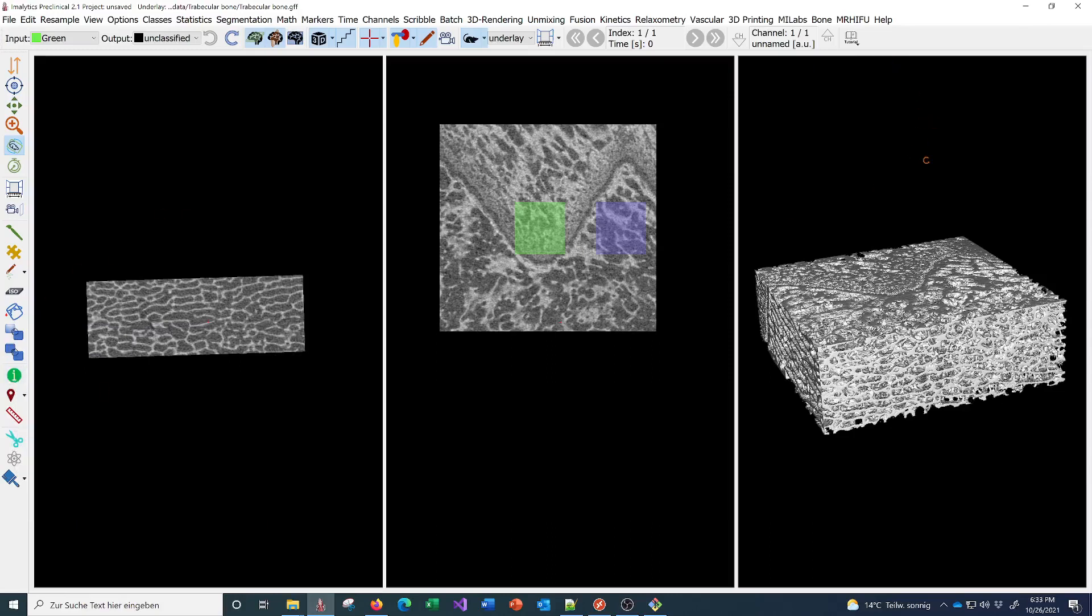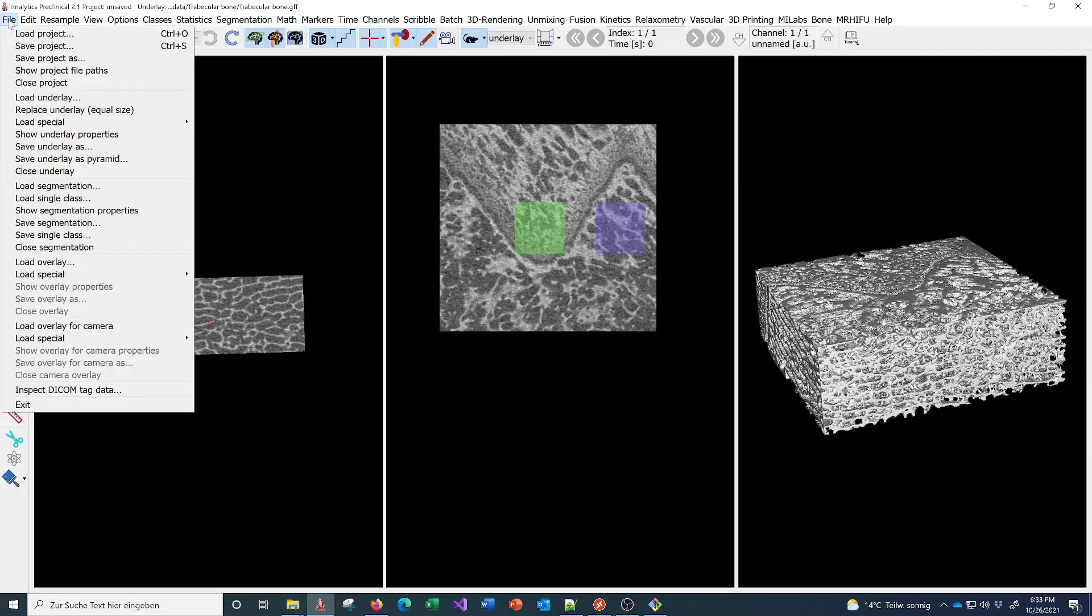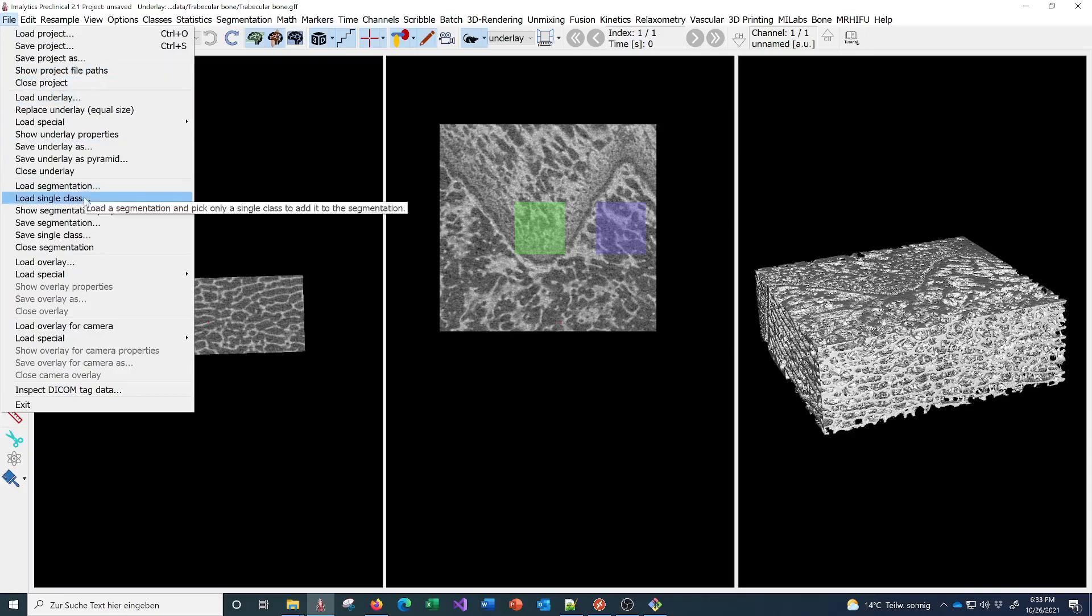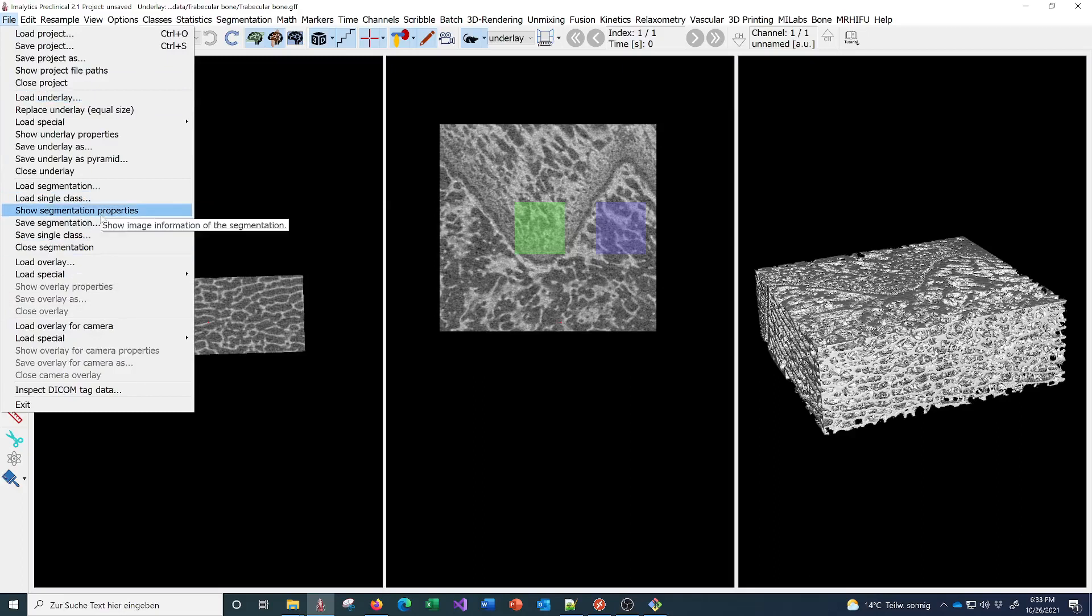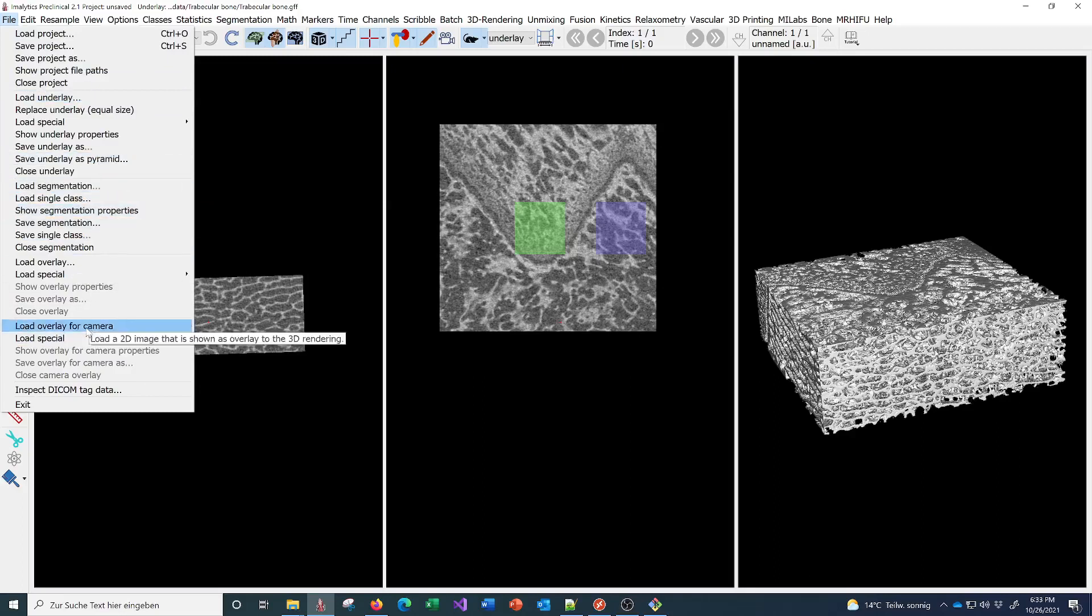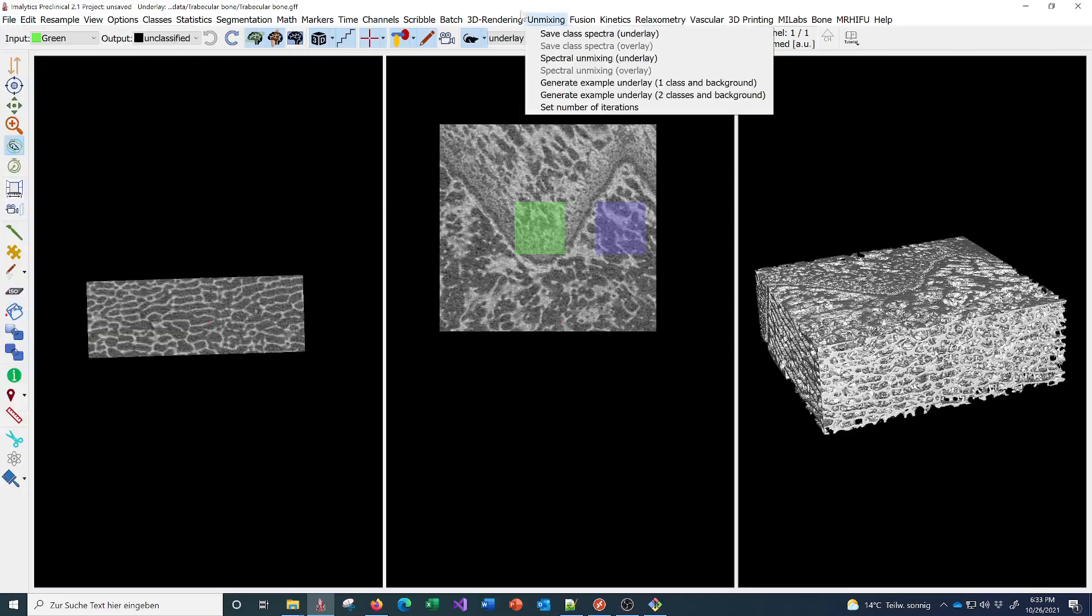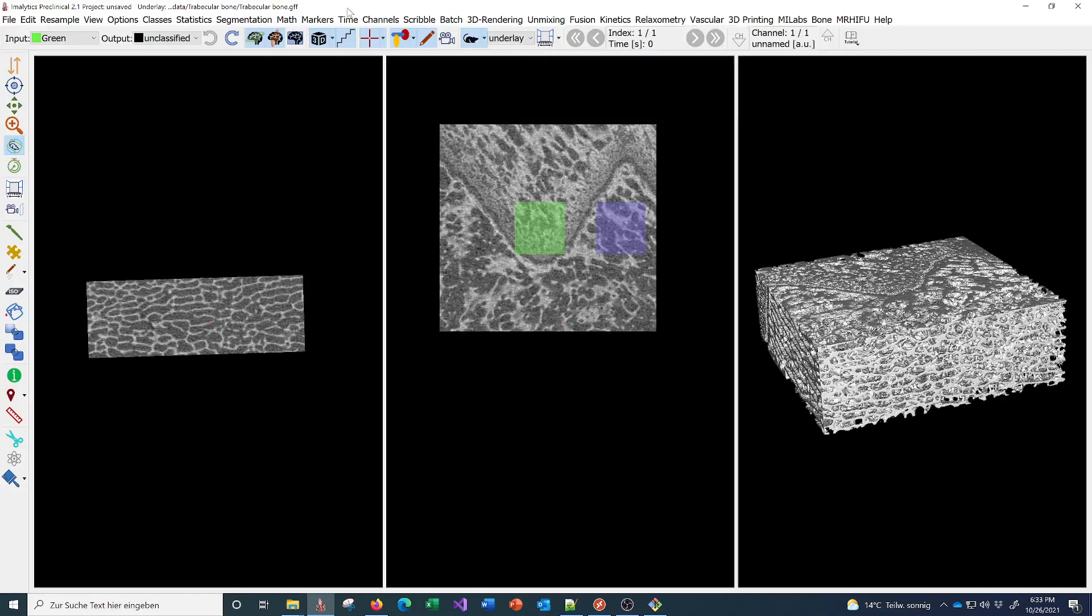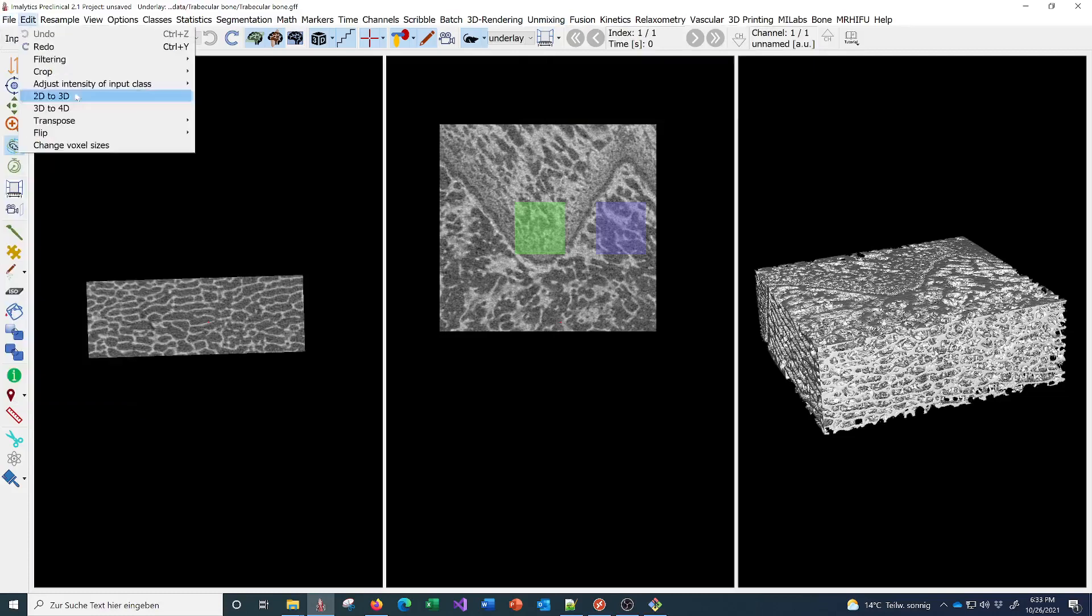Then you can of course load your own datasets here. You can load an underlay, load a segmentation and overlay, or a special overlay just for the camera, for example for bioluminescence data. Then you can process your own data and save the results in a segmentation file.